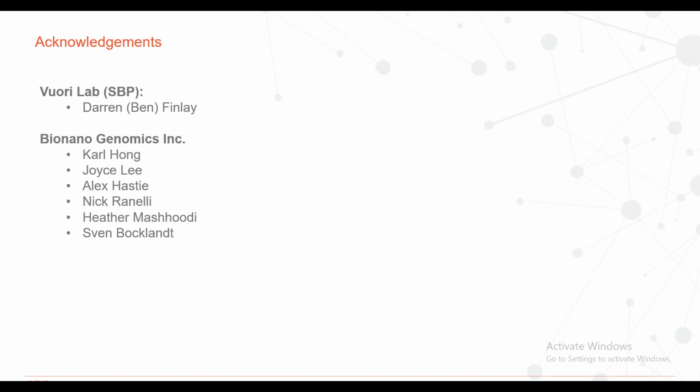So next question in the box here, could this technology be applied to microbial DNA? So yeah, that's a good question. So in theory, yes. In reality, I think there are some limitations on the value that we provide. Our strength is megabase-sized molecules, and sure, that works for bacterial genomes, but you can realistically do bacteria and metagenomics with PacBio as well.